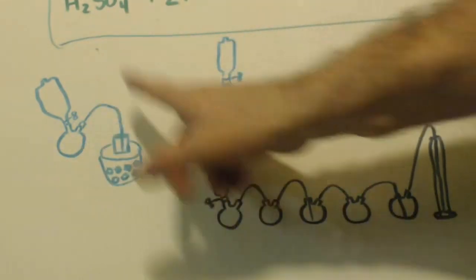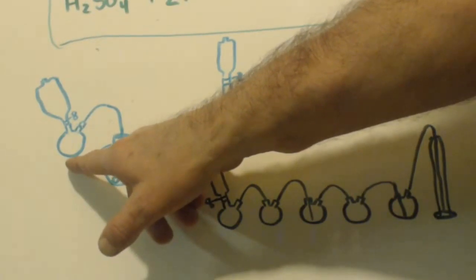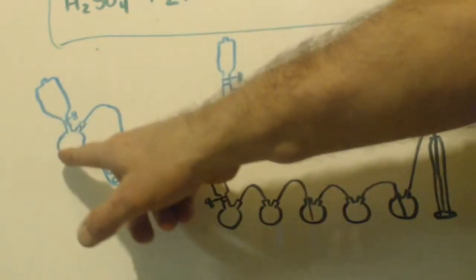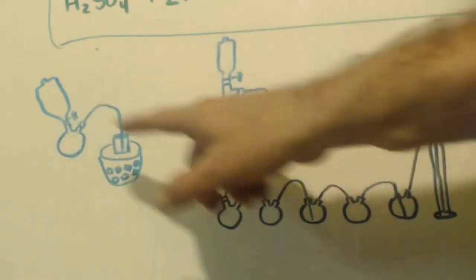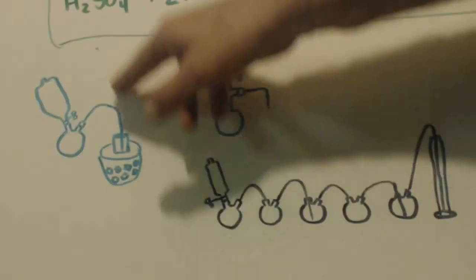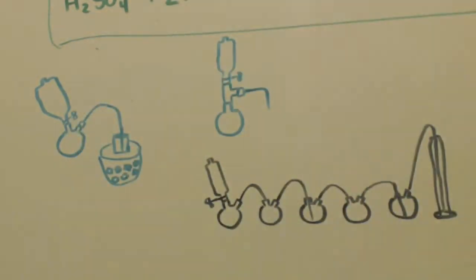You've got to watch for suckback, all right? If you don't keep up your production and you stop production, you're going to have a suckback. You're going to stop creating gas. The gas will all dissolve in here, and then you'll have a vacuum, because as the gas comes out, you have empty space now, right? It's going to suck up all your crap into this flask and ruin your reaction, all right? And that's why you should put a suckback trap on.